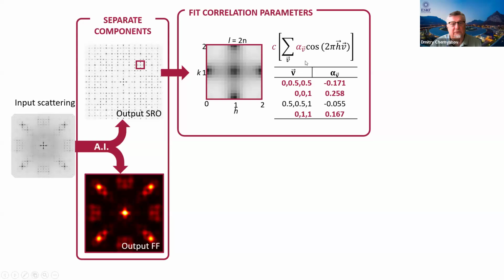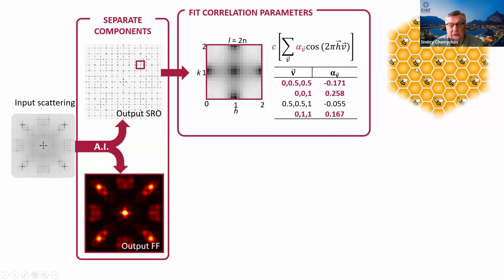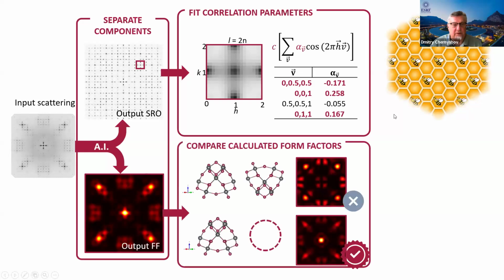You can refine the coefficients in this cosine series, and you need just a few of them. From the signs already, you see they're correlation coefficients for the nearest neighbor, next nearest neighbor, etc. So it's negative, positive, negative, positive. So what we have is this: these clusters don't like each other. The nearest neighbor is negative, so it prefers to have an empty pore close to it.